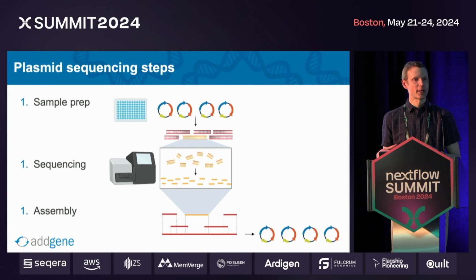And so when we have a batch of plasmids that's ready for sequencing, we label each of the individual plasmids with a unique barcode, and then copy a fragment of the plasmid, including that barcode, which we then, sorry about the numbering there.